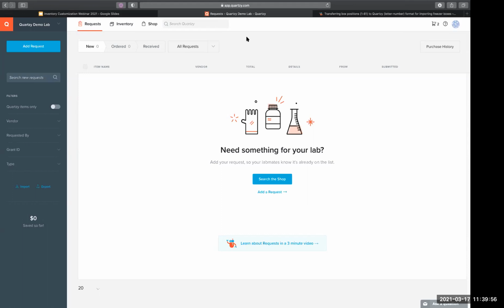Yeah, and that was it for the inventory. So if you have any other questions, we can definitely go over those now. Okay, perfect. There's a lot of conversation happening in the chat. So there was a really good question about, can you add pictograms to the inventory?